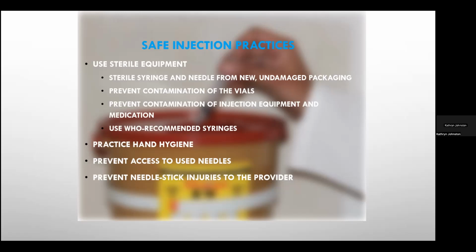should have a sharps container at your hands, right at the bedside with you if you are doing phlebotomy. So you want to make sure that you don't have to carry the needle somewhere to dispose of it. And then collect used syringes and needles at the point of use, and those containers should be puncture and leak proof, and they should be sealed. Those containers should be sealed when they're 3/4 full, to avoid needles from popping back out and causing sharps injuries.